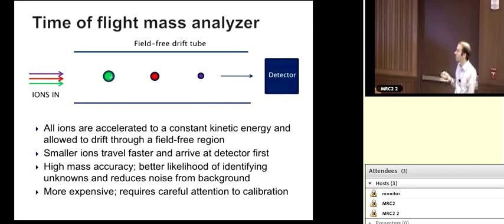But the way this works, instead of moving ions through a field or a quadrupole, it traps ions in an interesting toroidal-shaped trap, and these ions rotate around it based on the manipulation, again, of electric fields. Based on the pattern in which they rotate, different ions adopt different trajectories. It induces a frequency, and you can measure that frequency of the electrical signal generated by the ions, and you can do a Fourier transform, if you like math, and then convert it to a mass spectrum.